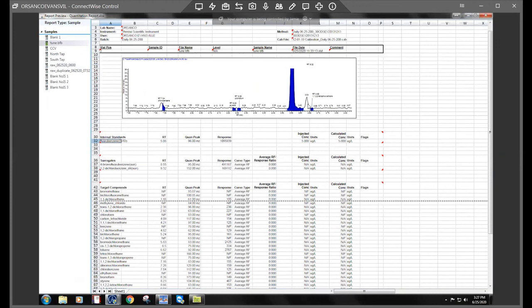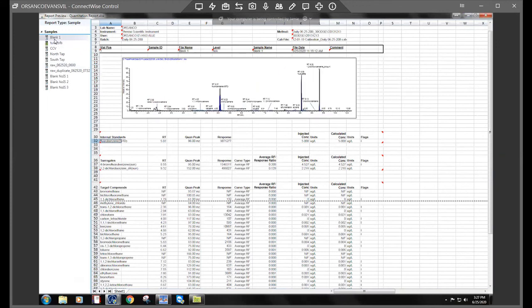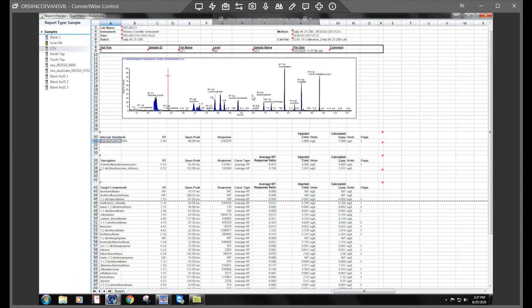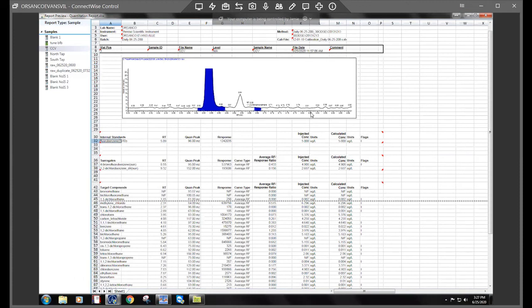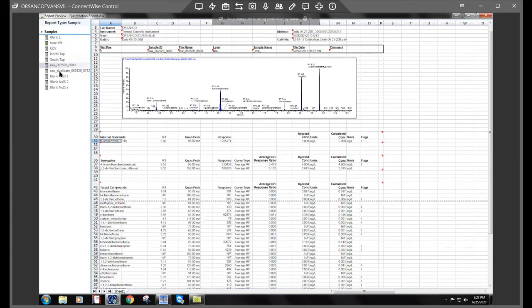We see both of those little peaks coming through in the blanks. So to me that indicates that it's in the column somewhere. So it's probably a contamination.